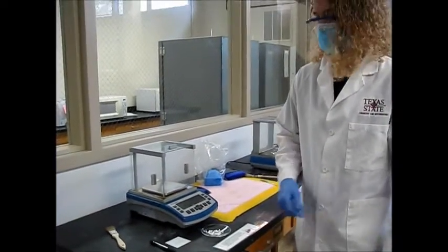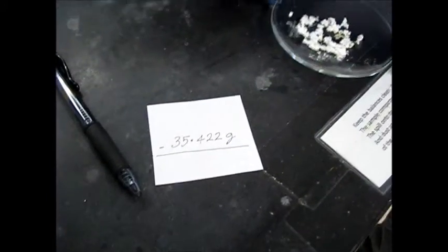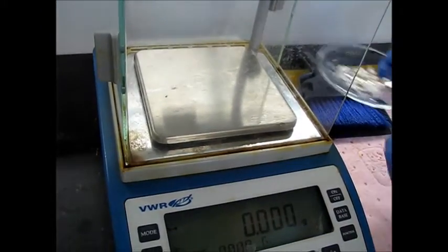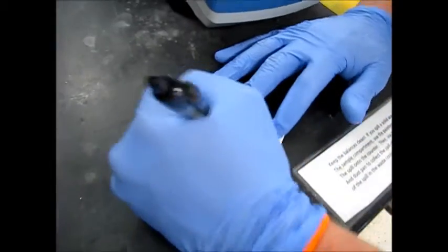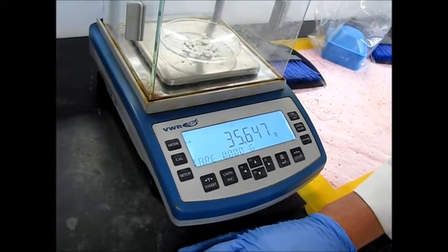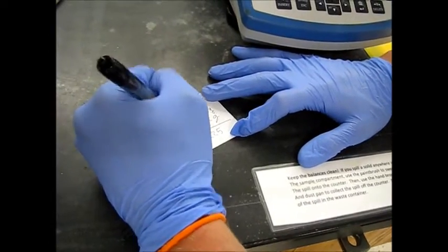So we weighed the watch glass beforehand, before we even started the vacuum filtration. We got a mass of 35.422 grams. So we'll be subtracting that mass from the mass we get right here. Make sure that it's zeroed out. Go ahead and get this weight. 35.647. Awesome. So we'll go ahead and write that down. 35.647 grams. So to find the actual mass of our product, we'll take the difference of these two. So we'll get 0.225, so just over 225 milligrams.